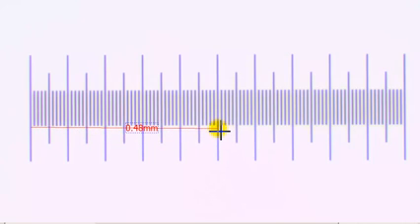0.48, that's close enough right now just for this demonstration. So every time that I do measure it, it's always going to come up that accurate. So let's go ahead and calibrate for the other objectives, okay?